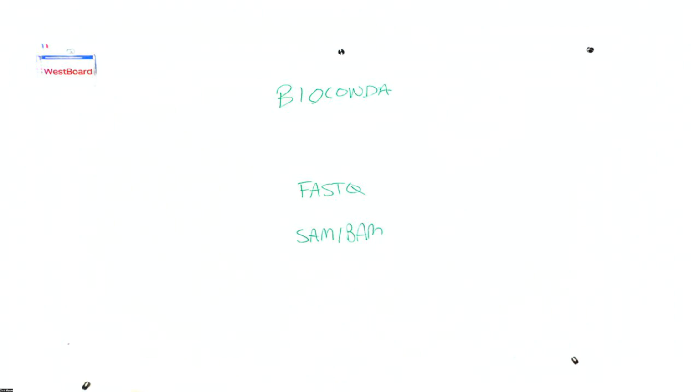The formats that are likely going to be newer are the FAST5, POD5, and SLOW5 / BLOW5 formats, with BLOW5 again being the binary version of the SLOW5 format. These are basically all various interchangeable formats that allow you and Nanopore to organize the raw signal information that comes through the Nanopore. So as you saw in the last slideshow, we had videos and lectures of individual nanopores, and we saw runs of either DNA or RNA moving through those pores.